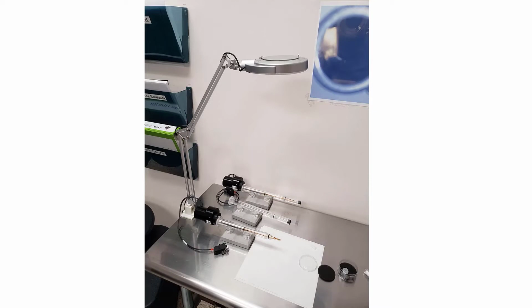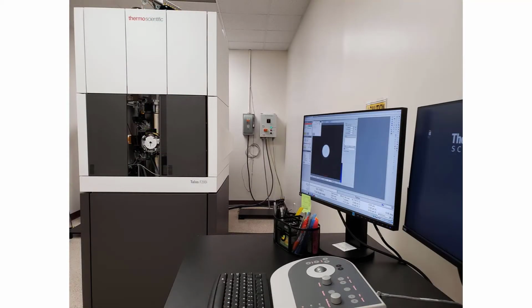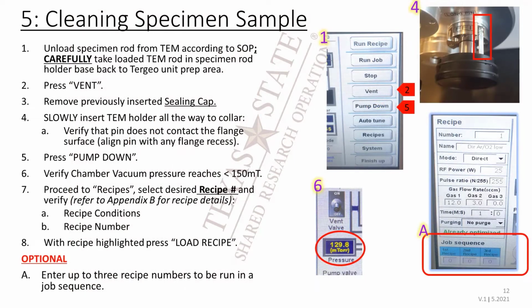Load your TEM specimen sample into the rod as you normally would, and verify it is secure by turning or tapping. Image on the Talos TEM as you normally would. If you discover that your sample needs cleaning while you are imaging on the Talos TEM, proceed to the following steps. Carefully unload your specimen rod from the Talos TEM according to standard SOP.